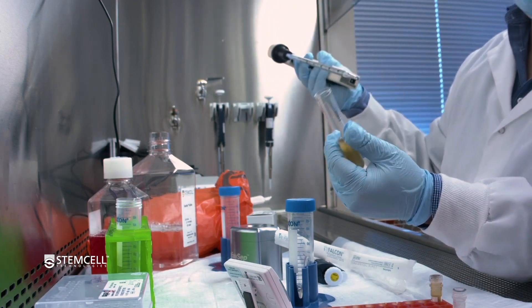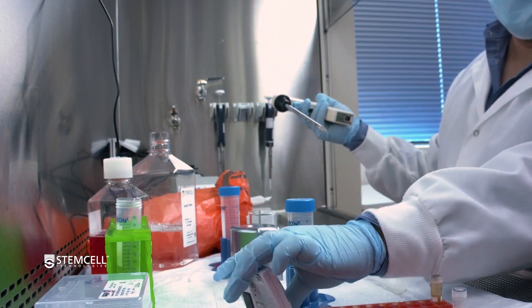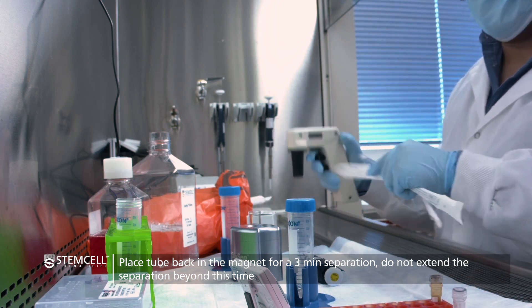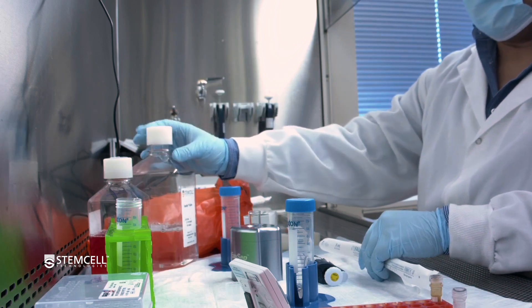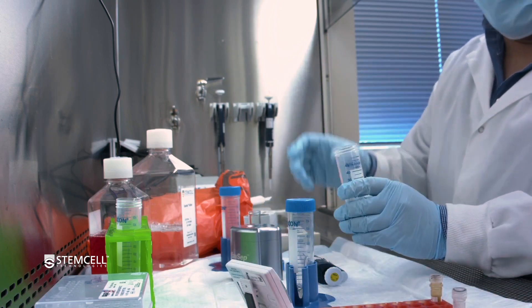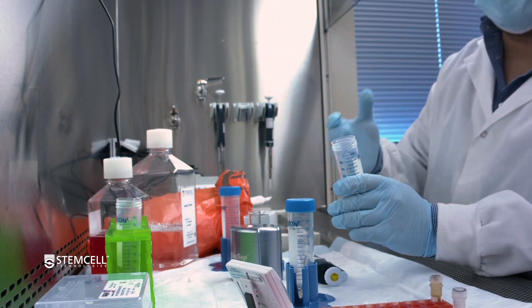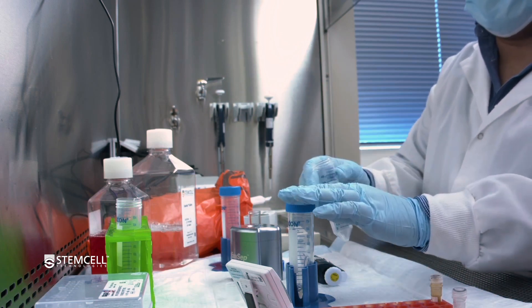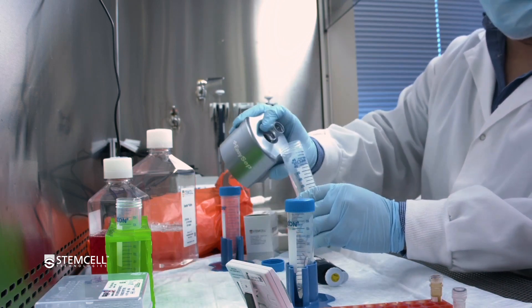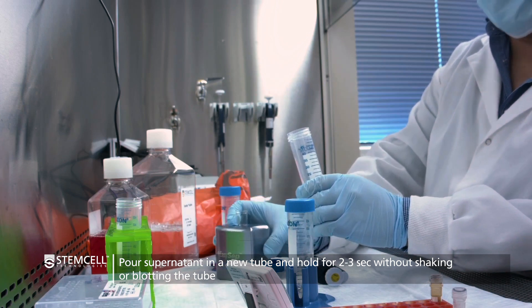Once you're fairly satisfied that this has been sufficiently resuspended, place this back into the magnet for the same magnetic separation time — in this case, three minutes. Make sure the cap is off when doing a magnetic separation. Once the separation time has elapsed, take that magnet and pour out your desired fraction. Hold for two to three seconds, do not shake or blot.